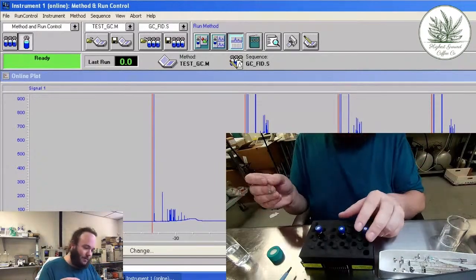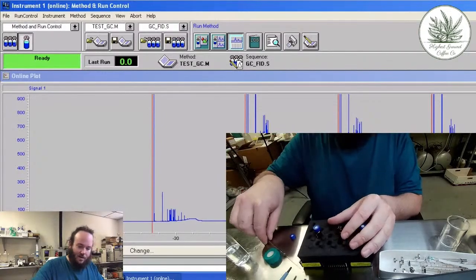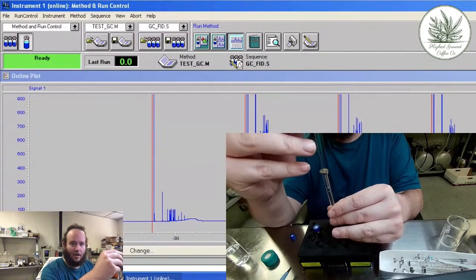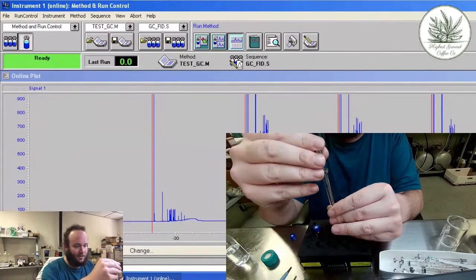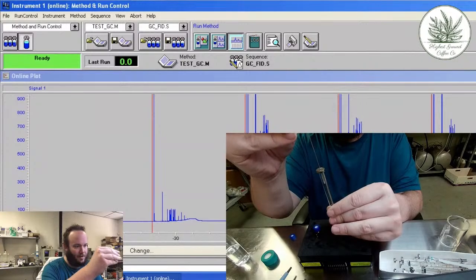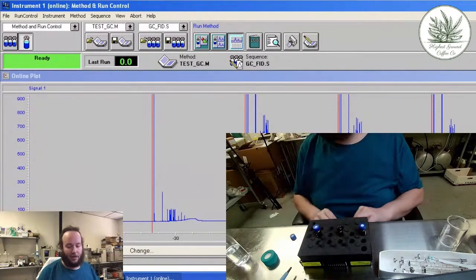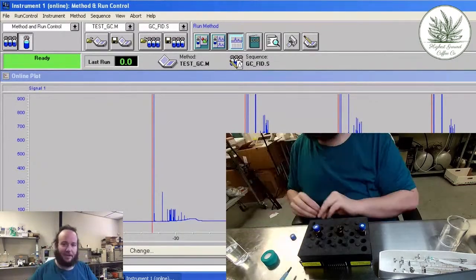Now what I'm going to do is decap this guy, put my needle in there, and all I'm doing is this flushing mechanism in the hopes that the reason it didn't show half as much signal is because it didn't mix in the vortex.